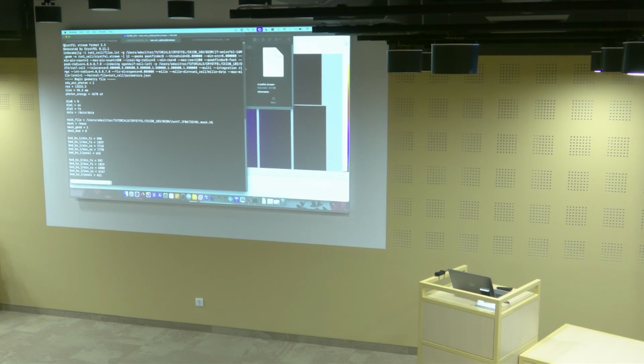So the crystfile header contains, again, all the parameters that we use to run it. So again, if you want to afterwards run the command line, it's very easy from here to take the arguments and run it in this way. Additionally, it's also very good logging, because 3 years later, if you did not write down somewhere which were the parameters that I used, it's written in this file.